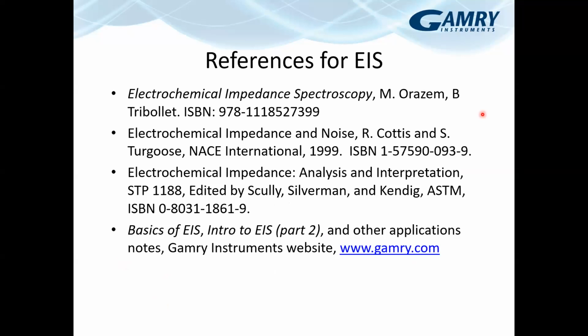This again was a basics of EIS. We're looking at understanding the technique and how it applies. The number of systems that it can apply to is any electrochemical system, and there is some valid and valuable data that you can get back from anything. That said, just understanding the technique is a process.